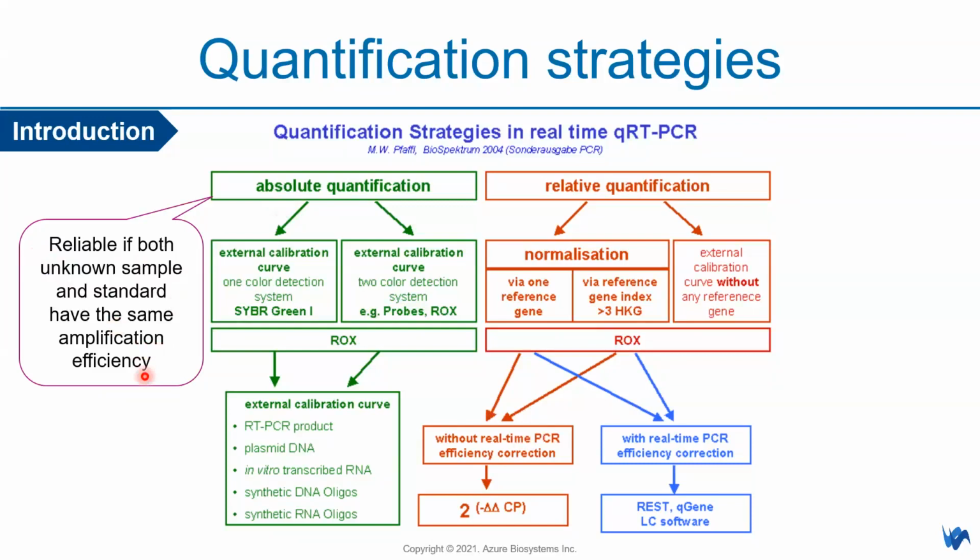If you have a certain knowledge of PCR or qPCR, you know that the underlying principle of PCR is that you expect a doubling, 2 to the power of n differences. I'll say the amount doubles every single cycle. So you have a double every single cycle, and that is what we expect. So we get an amplification efficiency of 100%, meaning by the factor of 2.